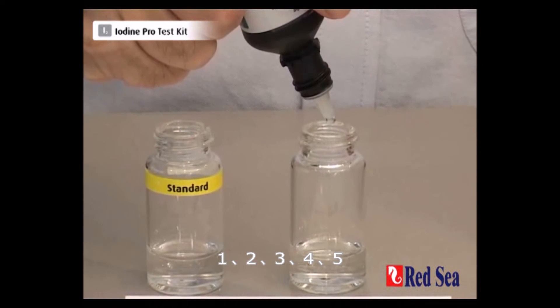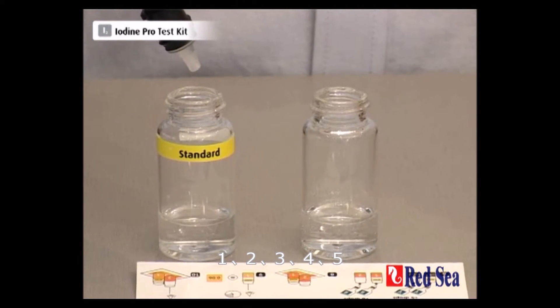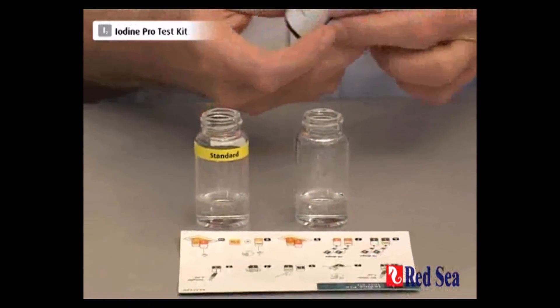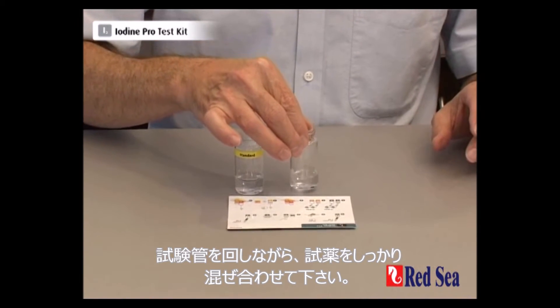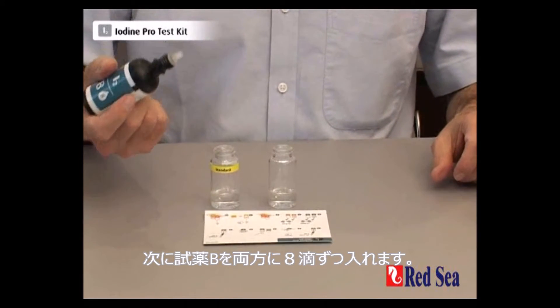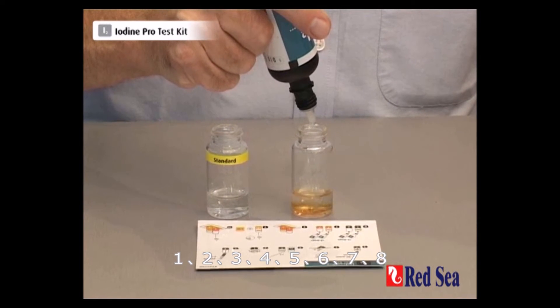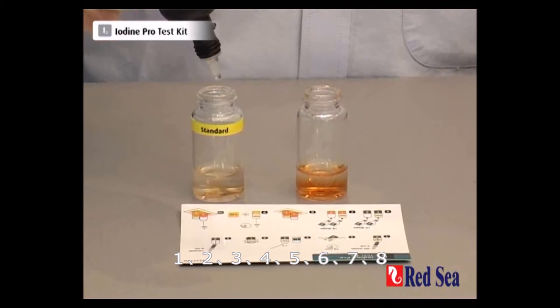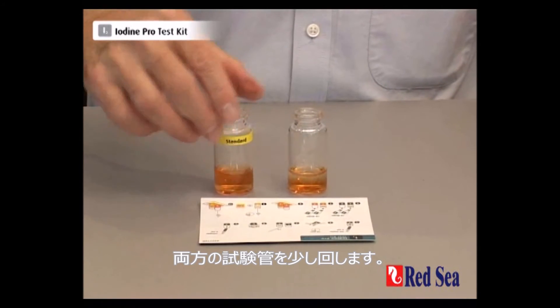Adding 5 drops of reagent A to the first vial: 1, 2, 3, 4, 5. Then 5 drops to the second vial: 1, 2, 3, 4, 5. And a little swirl for both.